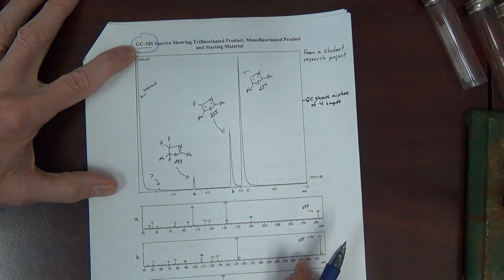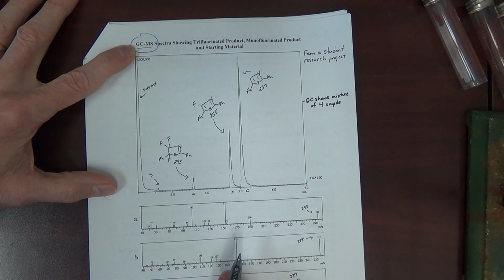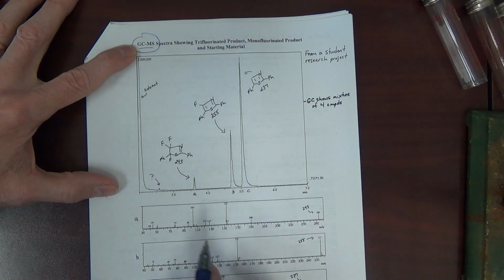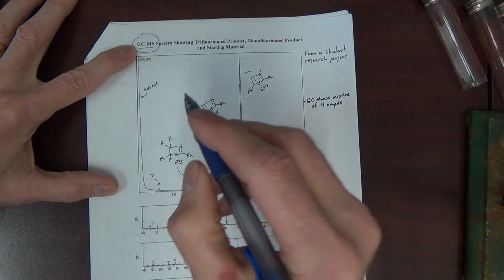This is a product from a reaction that was done in the student research lab. We had a product that was extracted from the reaction. We did a GC mass spec of that product. Is it pure? Or is it multiple components? This is the GC part.